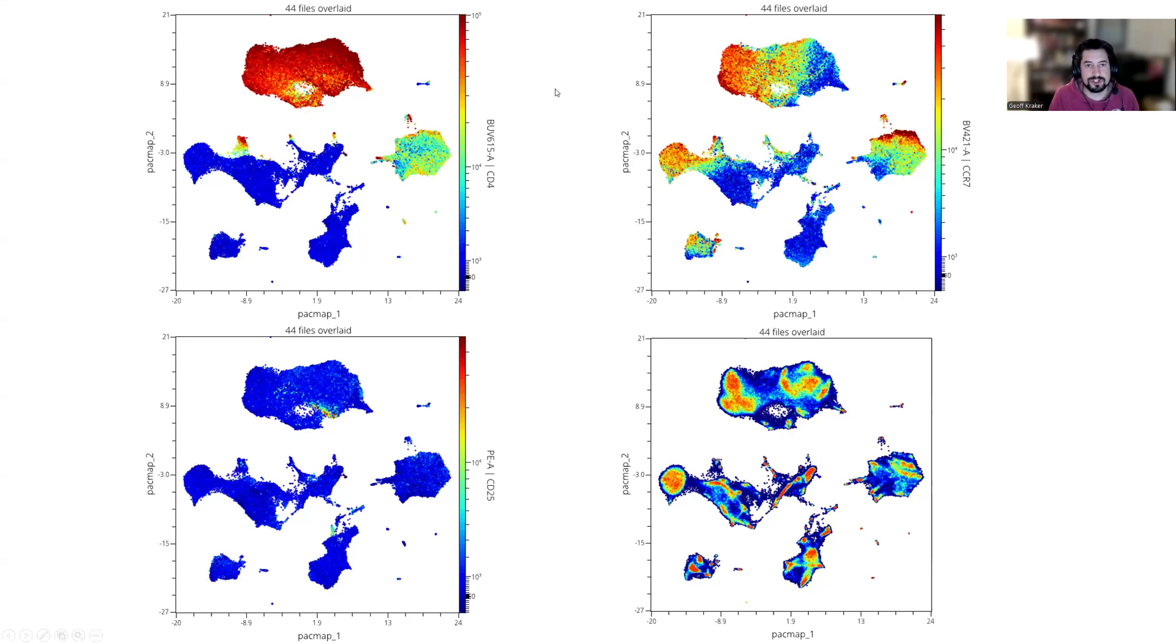So here's an example of some dimensionality reduction plots. In this case, they happen to be PacMap plots. Each of these shows the identical events plotted in the same coordinates, just colored by different things. This first one, we're coloring by CD4 expression. You can see this island is bright in CD4. This plot here, we're coloring by CCR7 expression. And you can see there's a gradient here of CCR7 expression, but the marker itself is not bright or distinct enough to break these out into their own separate island. And here we have just this little CD25 positive beach, but not even a peninsula or something, if we're going to really lean into that analogy. It's just CD25 in this little corner here on that island.